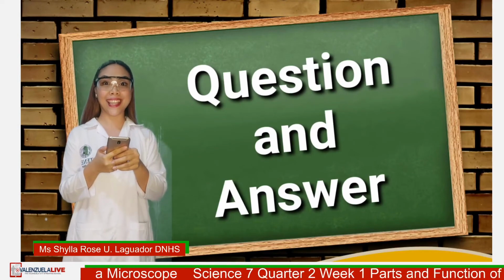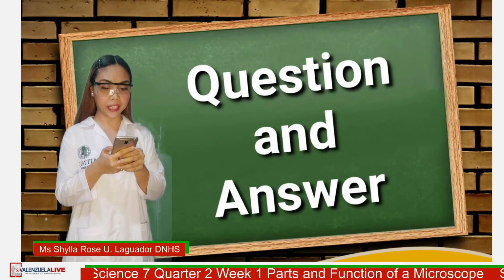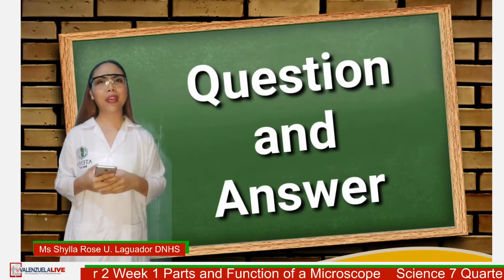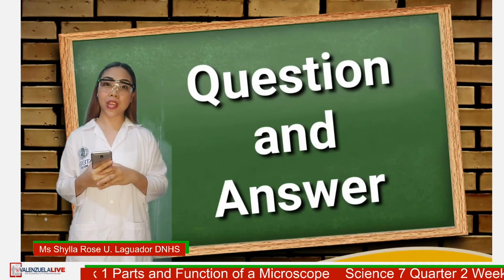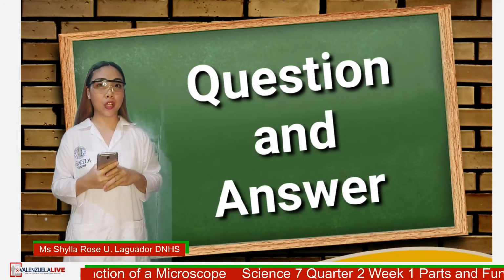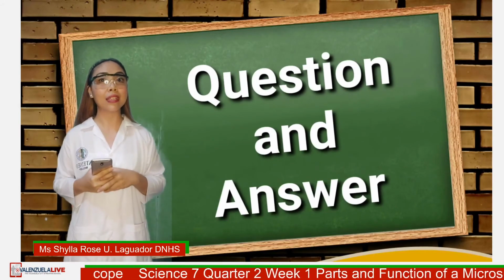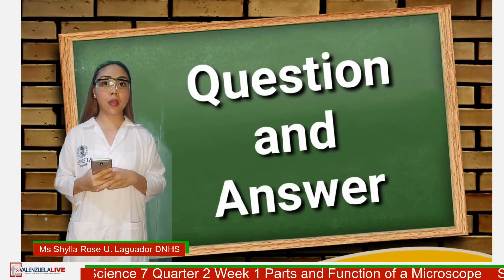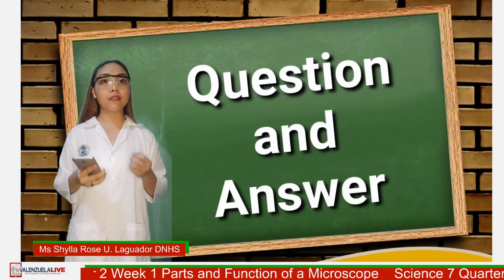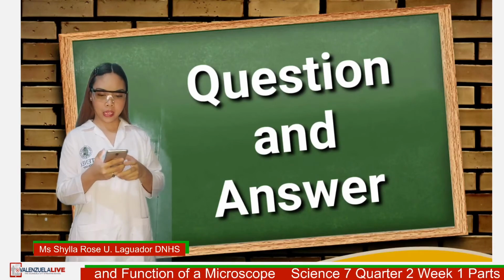Alright, from Mayasan National High School. Question is, what if there are some parts in a microscope that are damaged or broken? Can it still function? Well, generally, microscope is fragile and prone to breaking. That is why we need to take an extra care in using this particular instrument in our laboratories. But, when accidents happen and some parts are damaged, microscopists do not recommend to use it at all, since the results of experiments and studies might be affected due to this. Okay? So, last question.